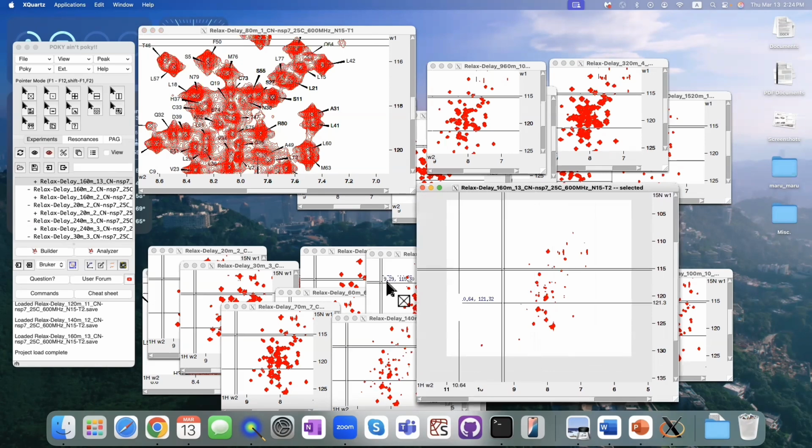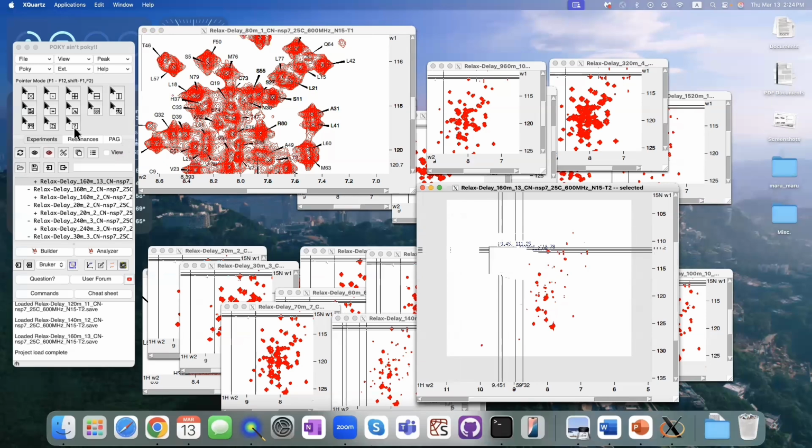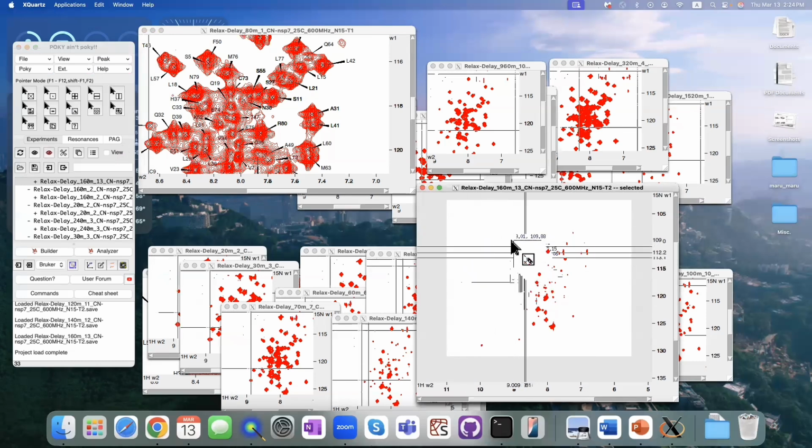First, you need to pick some peaks. You can do that by using iPick or apes, or just use F8 or 33 to change your cursor mode to find/add peaks. So that cursor mode is this button right here, or you can type 33 and that will change your cursor mode to be find/add.